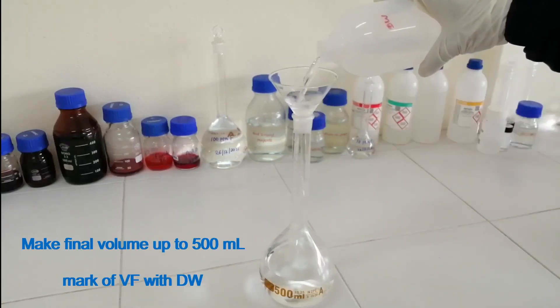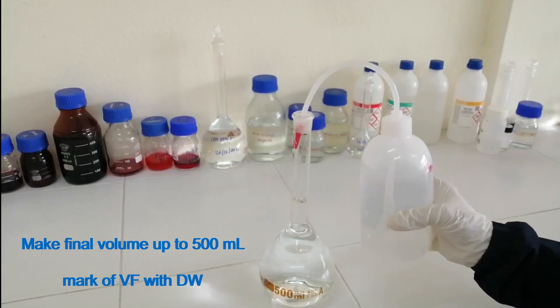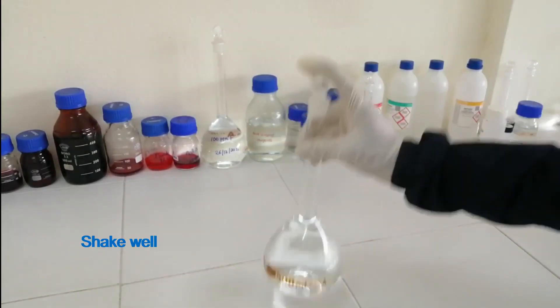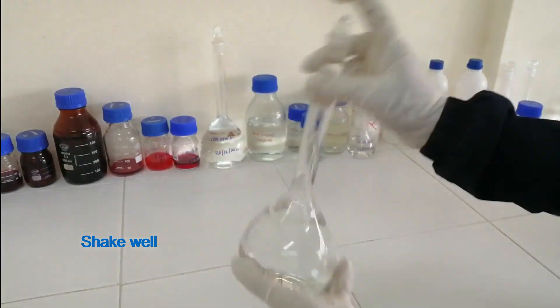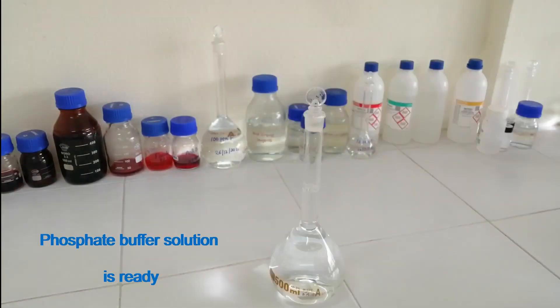Make the final volume up to the 500 ml mark of the volumetric flask with distilled water. Shake well. The phosphate buffer solution is ready.